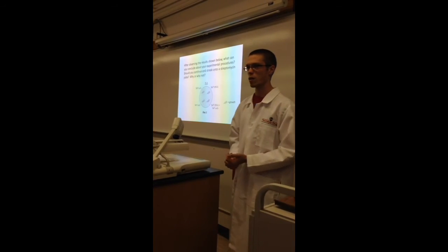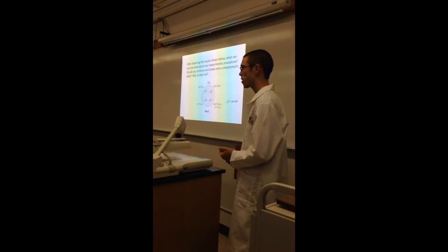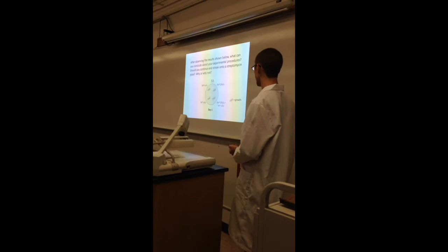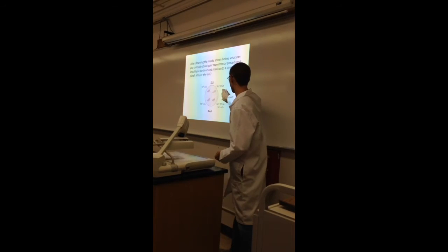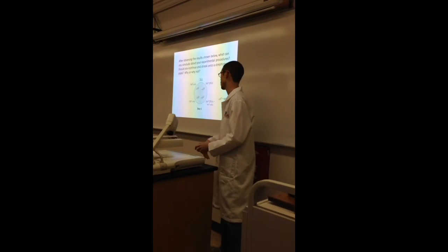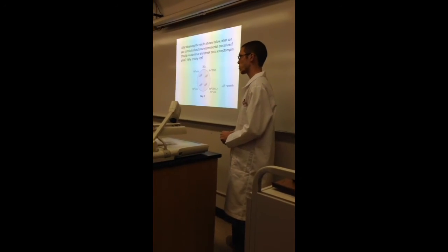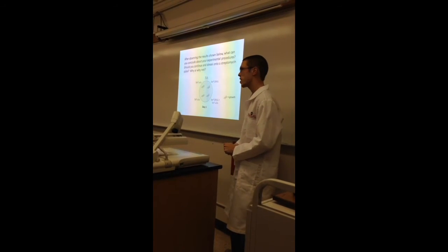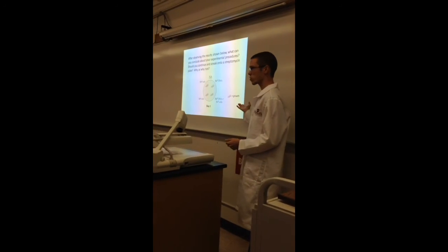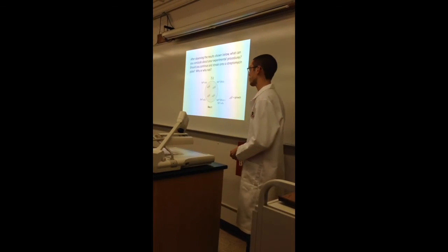This is the first day of the transformation experiment, streaking just on plain NA, and you have the strep-resistant cells, strep-sensitive, the DNA from the strep-resistant, and then the strep-sensitive with the strep-resistant DNA. Which of these quadrants doesn't belong? The DNA. The DNA, exactly. If you had results like this, would you continue with the experiment or start over? Start over. Okay, good.